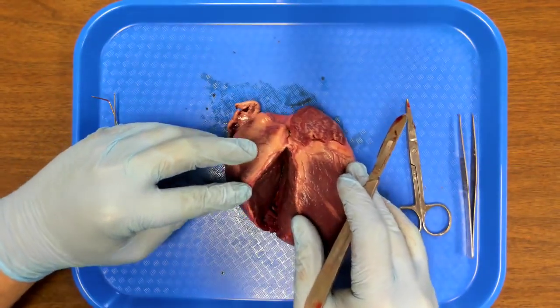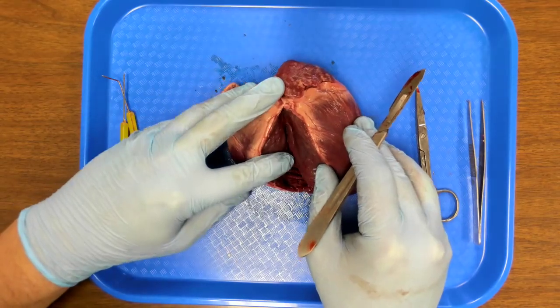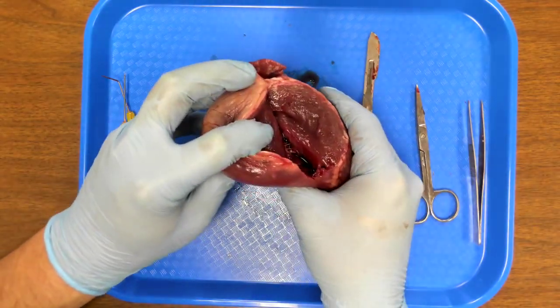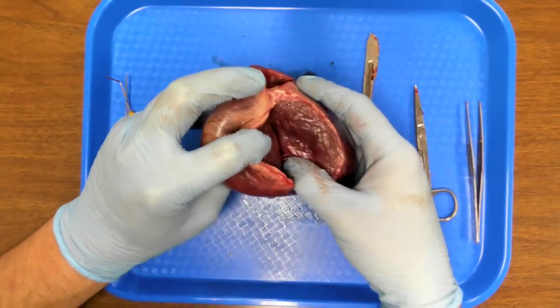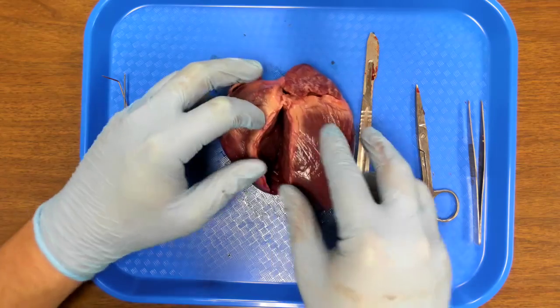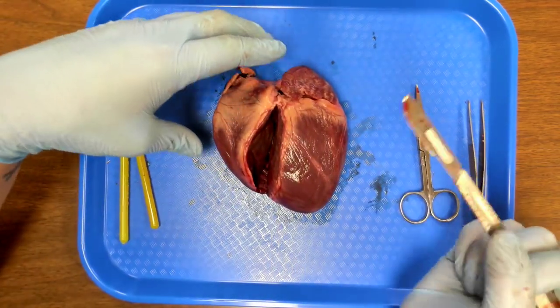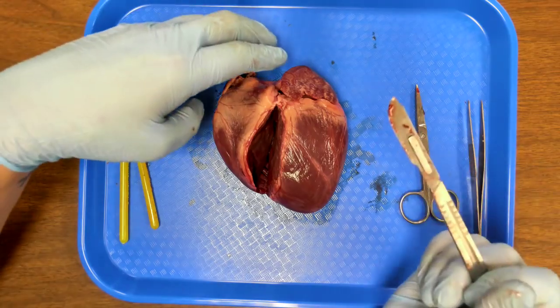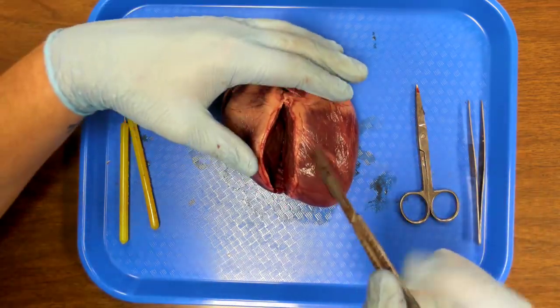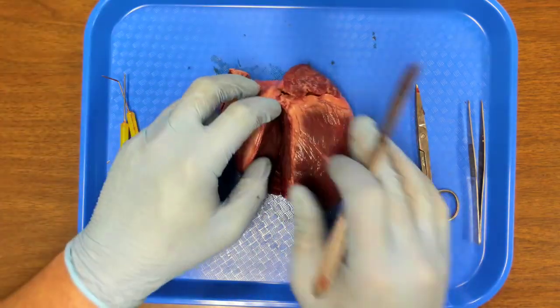Now, this doesn't look like a whole lot on the inside here. But if you notice, look at how thick this is. I mean, if I were to hold this way, it's a very thick wall of muscle there. The heart needs to be very thick, very strong, because it pumps all the time. It is made of that special cardiac muscle. It is involuntary, and that's good, because you don't want to have to think about pumping your heart.